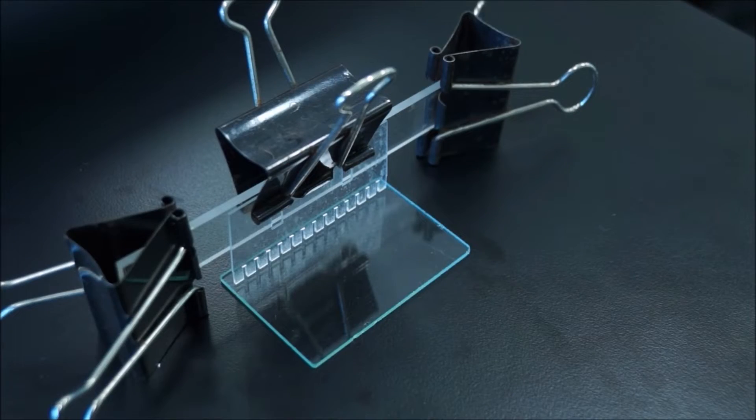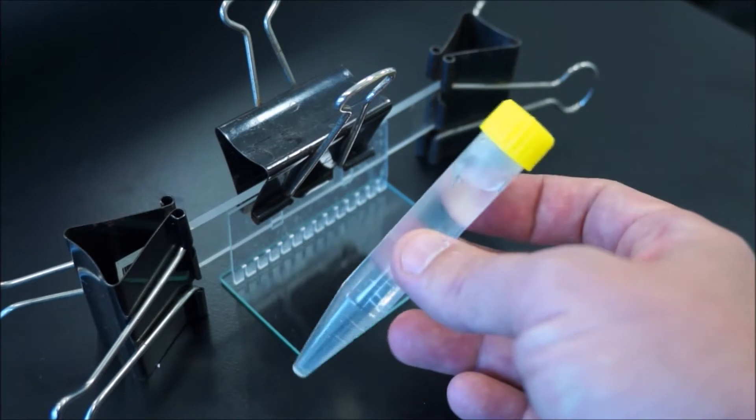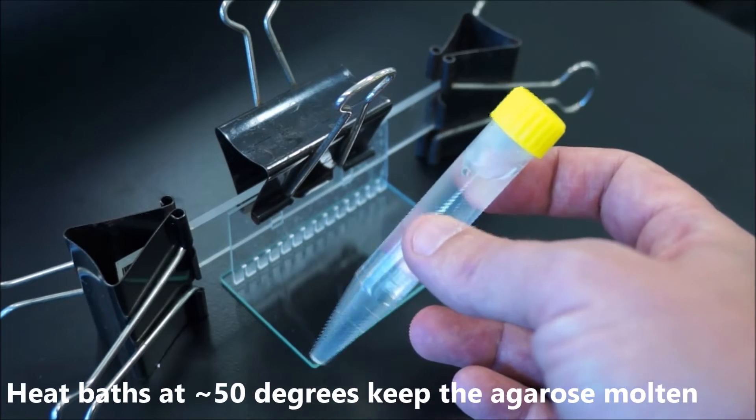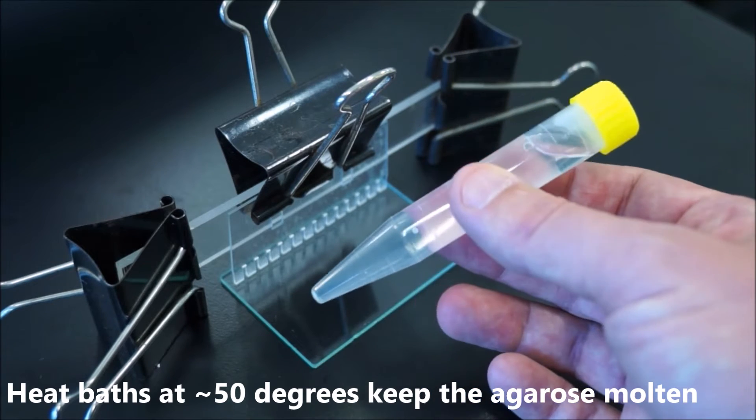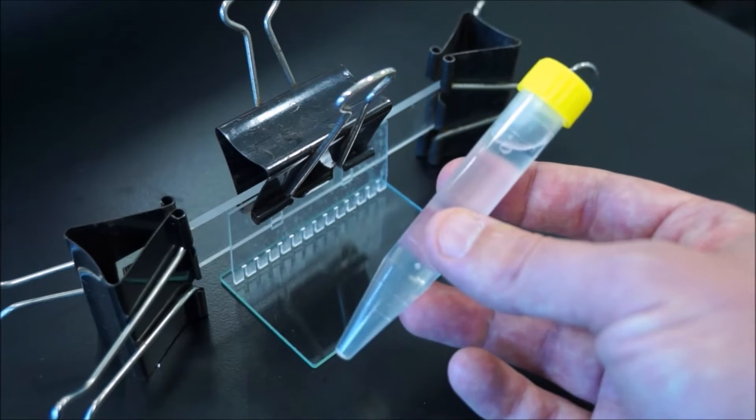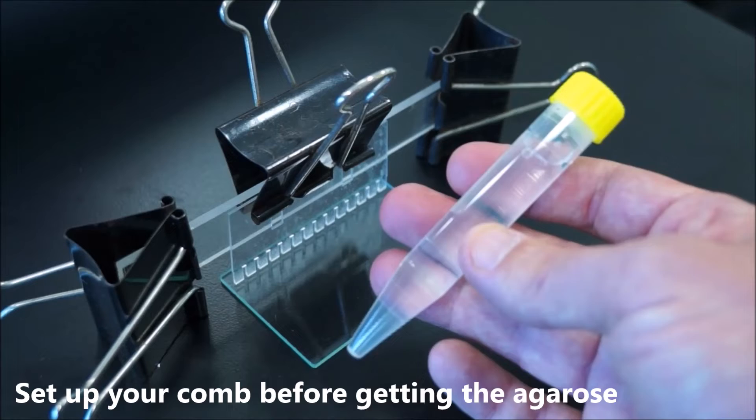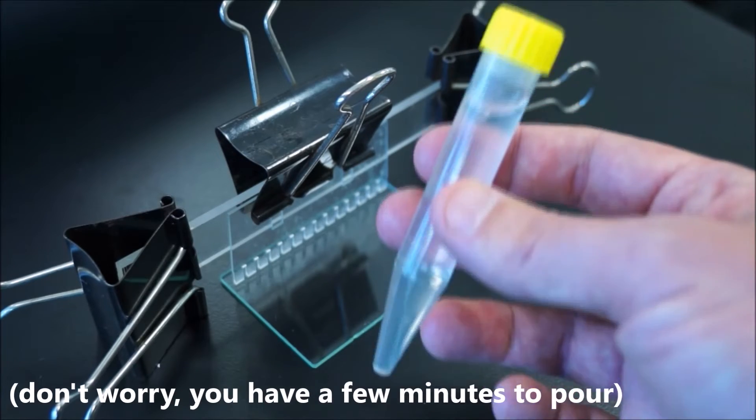The next thing to do is to find some molten agarose. They'll be in yellow capped tubes in a heat bath somewhere around the lab. There should be about 9 or 10 mils of molten agarose there. As it cools down it will solidify, so you have limited time to use this. Just be reasonably quick about it.